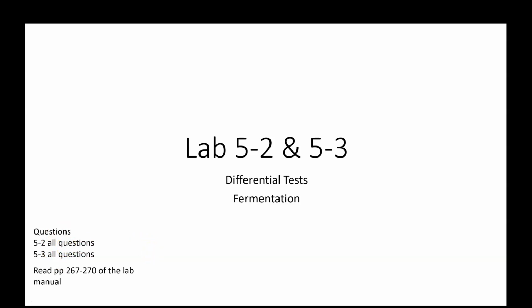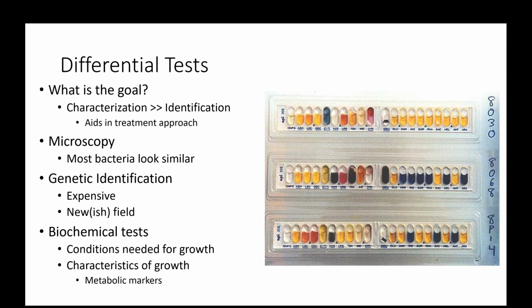All right, so let's go ahead and get started. Let's remind ourselves what the point of differential tests really is. What's the goal of this? Well, the goal is to characterize the bacteria and therefore be able to ultimately identify that bacteria. And once we have that identification, we can now figure out a treatment approach.